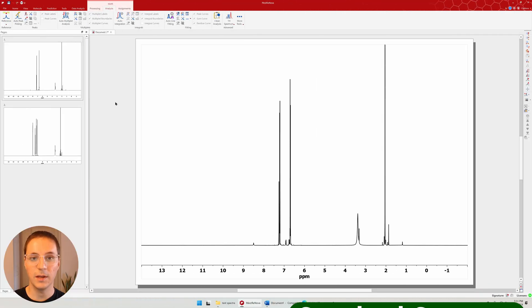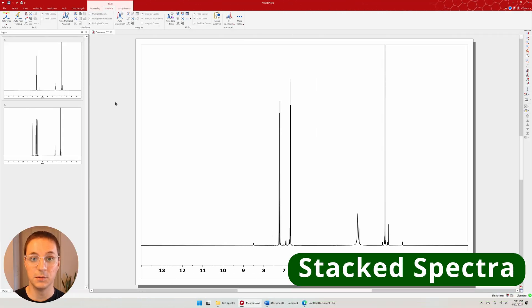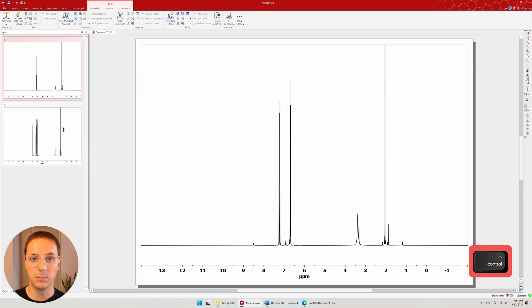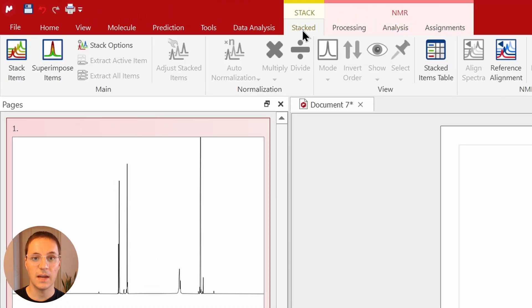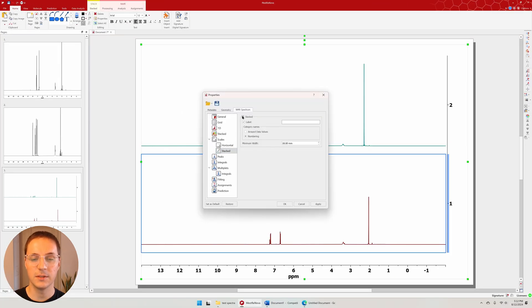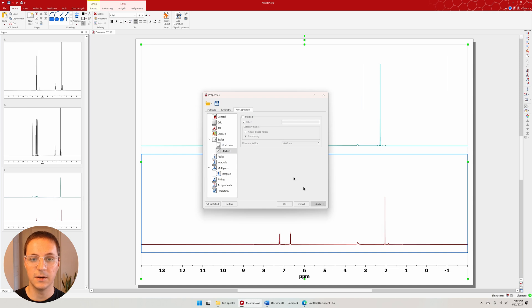If you'd like to compare two spectra, you can use the stack function. Hold Ctrl and select both spectra in the sidebar. Then enter the stacked tab and select stack items. This page has its own set of properties. I like to remove the stacked scale.